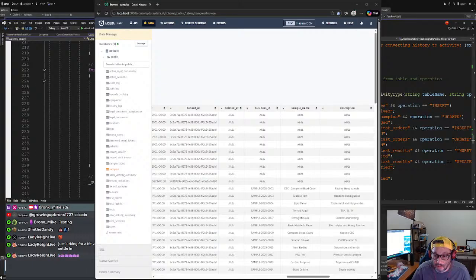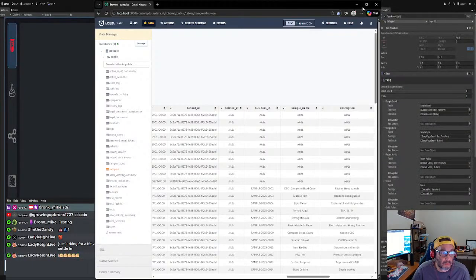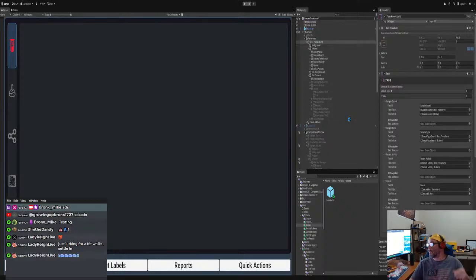All right, and then the sample type. Let's do that. Sample name. That's a go. Sample name. That's a go. All right. Let's see how that works now. All right. Loading up, loading up, loading up.